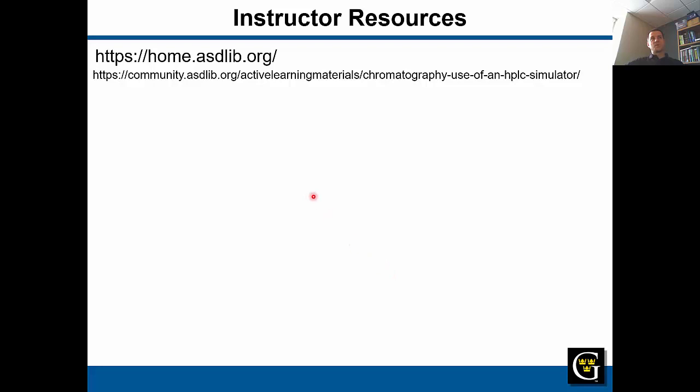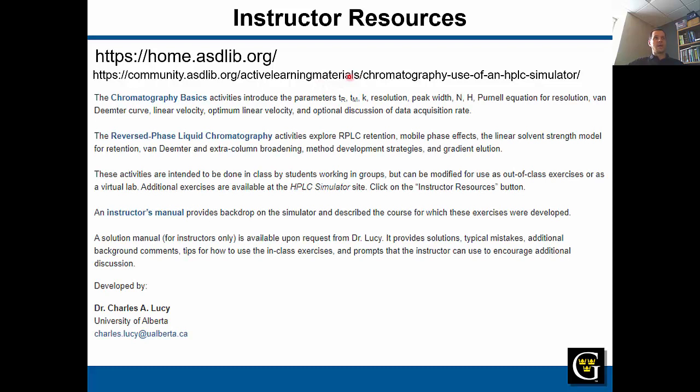By far the most rich resource, though, in my opinion, for instructors at the moment can be found in what was developed by Chuck Lucy at the University of Alberta. It can be found by going to the ASDL library website here. This is the main site. And if you search for HPLC Simulator, it will take you to this link here. And if you follow that link, this is Chuck's description of what he's developed.